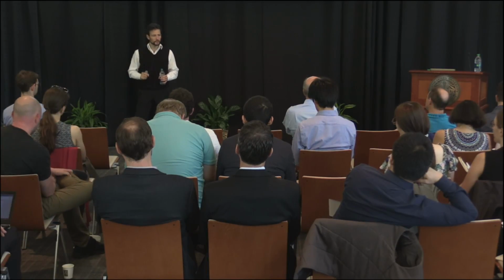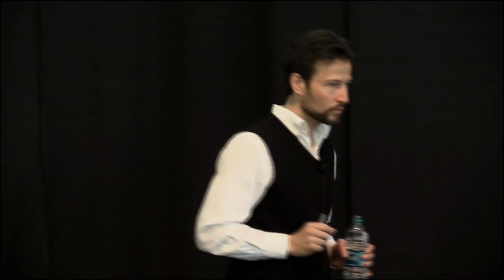I would like to use the MS2 spectra. The MS1 spectra, using it together with the retention time is OK. But I feel much more confident, at least in my work, in using both information at MS1 and MS2 spectra and the retention time, and this is what we have done. This is what I like in terms of the identifications, being able to assign a confidence for each sequence.